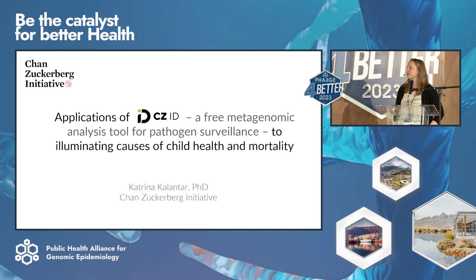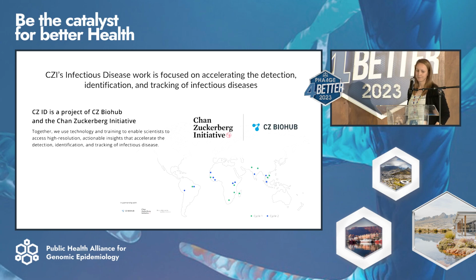So today I'm going to be talking about applications of CZID, which is a free metagenomic platform for pathogen surveillance, and really focusing on a pilot study that we did looking at causes of child health and mortality.